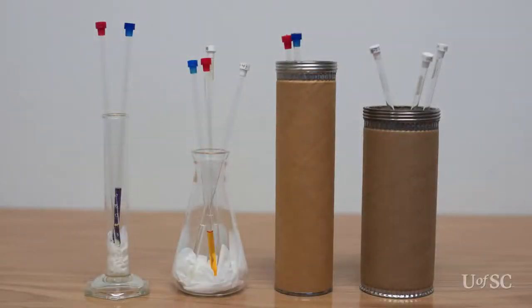Health and safety requires all chemicals be transported with secondary containment. This includes NMR tubes. Common containers include cylinders and flasks; however, cardboard mailing tubes have the advantage of being unbreakable. Either way, put some absorbent paper at the bottom to cushion the tubes and to be handy to clean any spills.